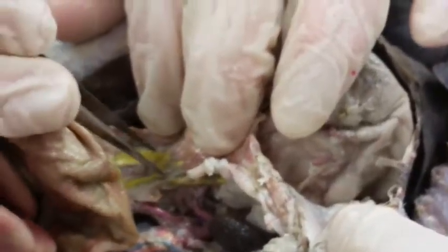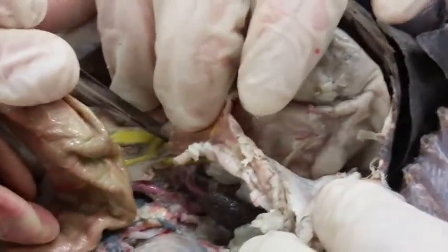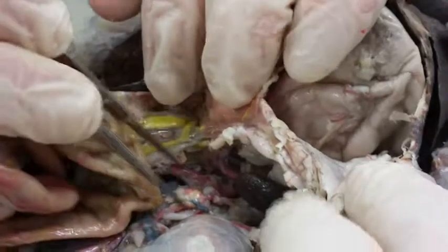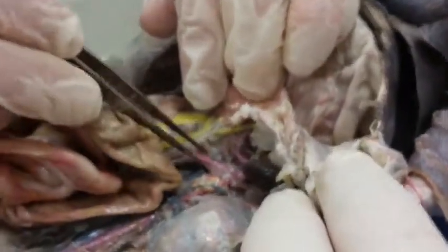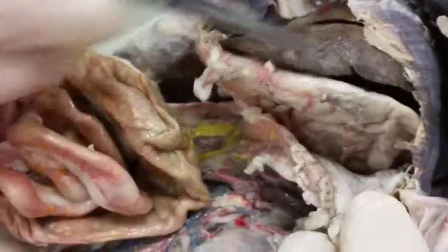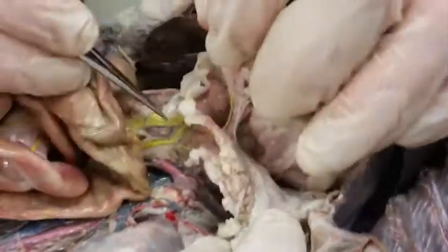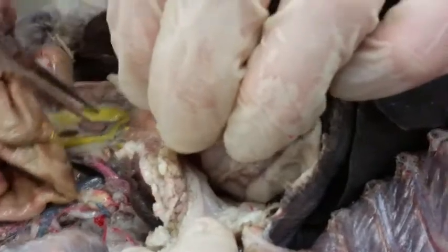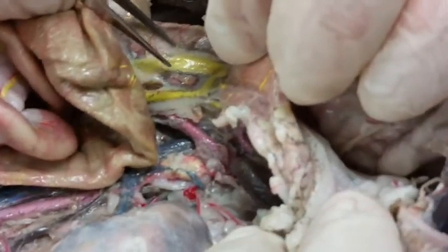hepatic portal vein, which eventually splits into two veins, but up in here is going to be the hepatic portal vein. And then again, just as a review, celiac artery, and then cranial mesenteric artery running off the dorsal aorta. Liver's up in this region. So we have, like I said, the hepatic portal vein is up in here, and then we have these branches down here which are more visible for us.